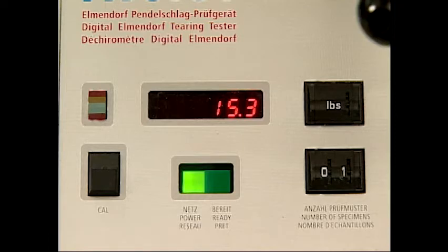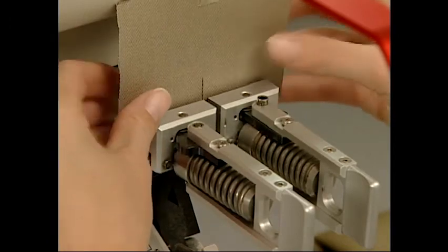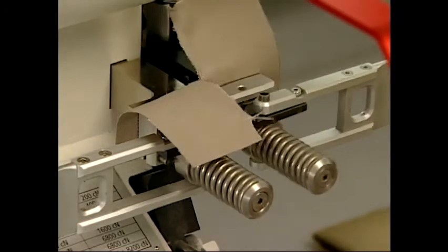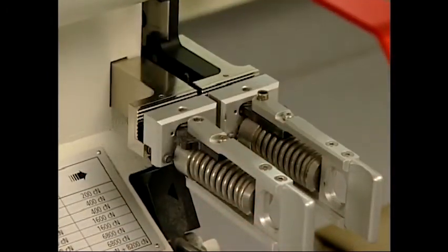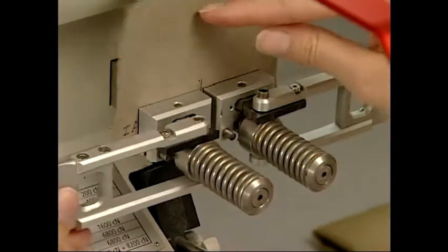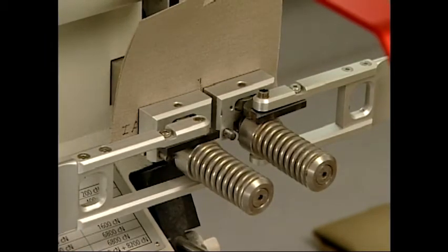The resistance to tearing is directly indicated by a pointer and scale system or a real-time monitor that shows the tearing force. This value of 15.3 pounds is the tearing strength for the warp yarns. This value indicates the force the yarns in one direction need to propagate the initial tear. Normally, 5 tears are recorded for each fabric direction. Calculate the tearing strength as the average tearing force in pounds force for each direction.